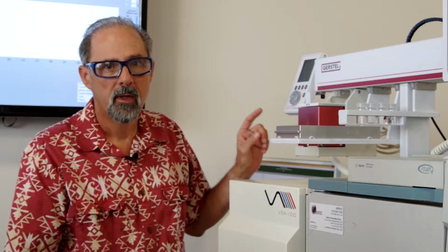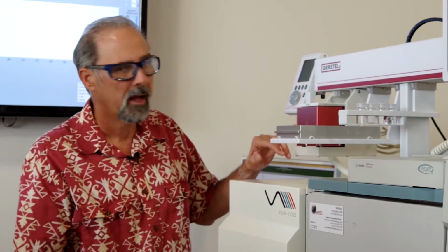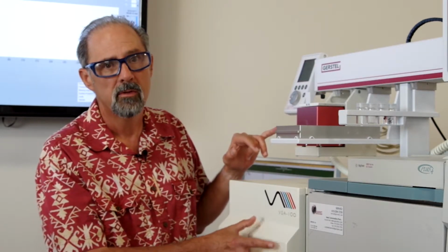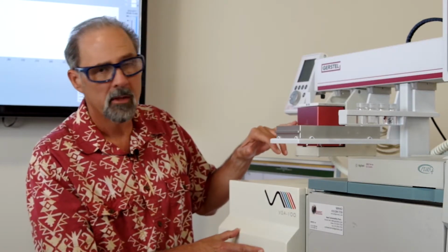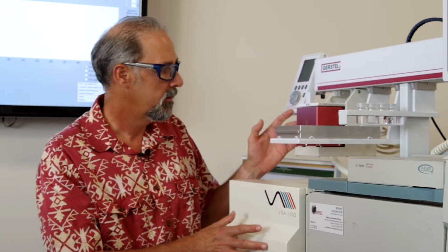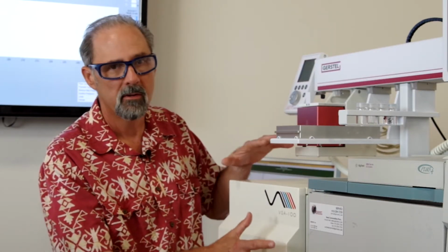I mentioned earlier that we use the Gerstel MPS2 autosampler for the static headspace work that we're doing with residual solvents. And this is very important because it allows a faster equilibration time so that we can match that with the fast GC VUV that we're doing for residual solvents and pharma work to increase throughput. The Gerstel system employs shaking and heat to do the equilibration, where not all static headspace autosamplers do that. This shaking combined with the heat results in a fast equilibration time that matches very well with the analytical runtime.